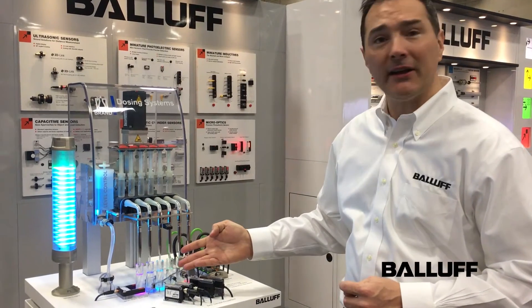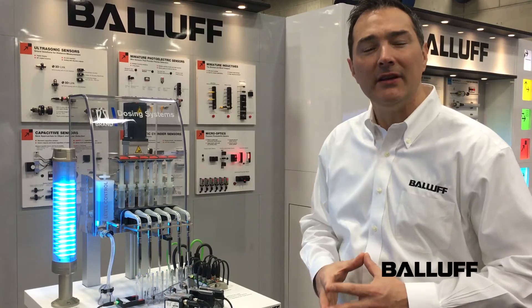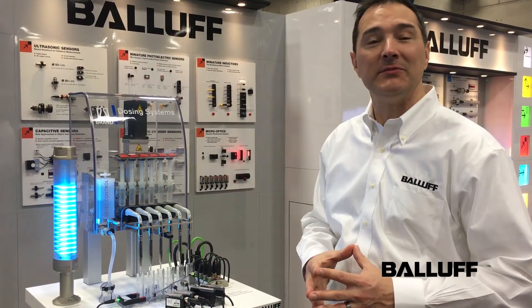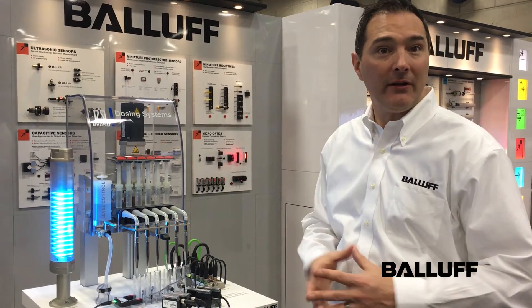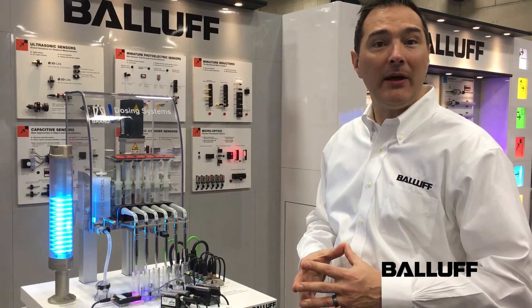Three of these sensor technologies are photoelectric, which are best suited to higher precision liquid dispensing applications, for a higher precision liquid level, or detecting the dispensing of liquid — for example, at a pipette tip upon dispense, which can confirm that a liquid was dispensed underneath the pipette tip.